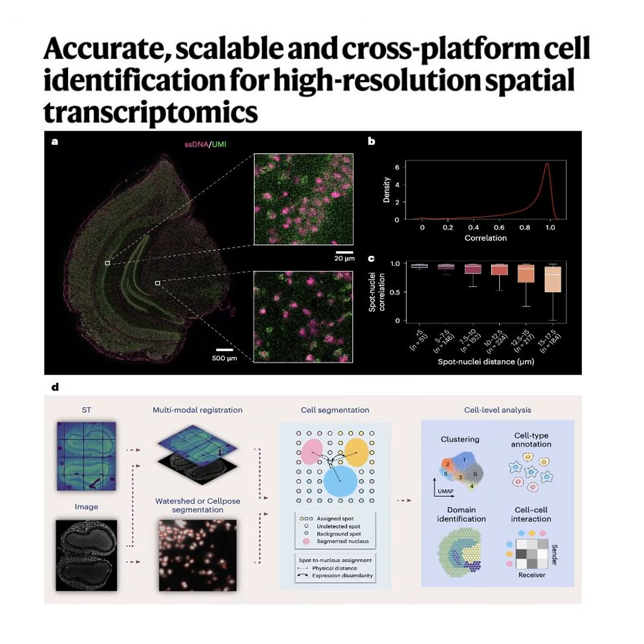Which is amazing, but that brings us to the root of the cell segmentation problem, right? This phenomenon they call transcript diffusion. Yeah, this is the killer. To get the RNA out of the cells and onto that sticky barcode net, you have to permeabilize the tissue. You use chemicals to literally poke holes in the cell membranes. And I'm guessing the RNA doesn't just drop straight down. No, it leaks. It diffuses laterally across the slide. So the pristine, sharp boundary of a cell suddenly blurs into this fuzzy, overlapping cloud of molecular data.